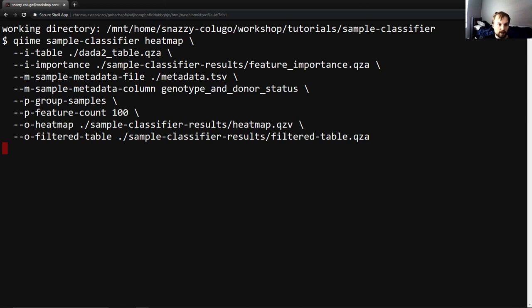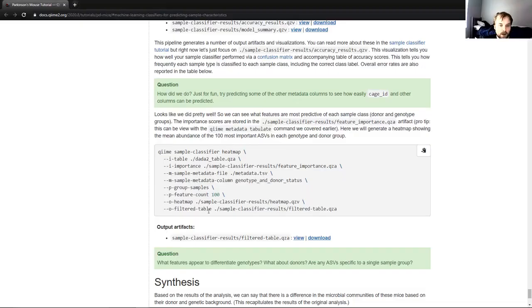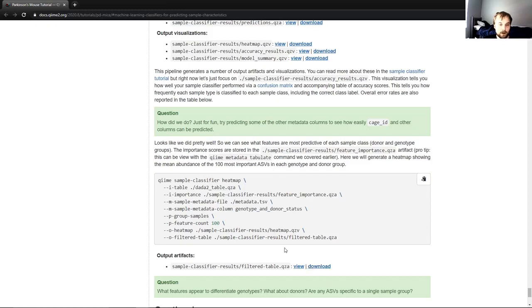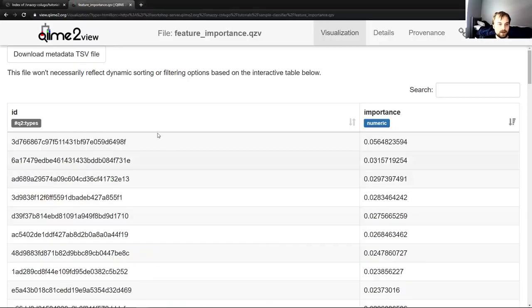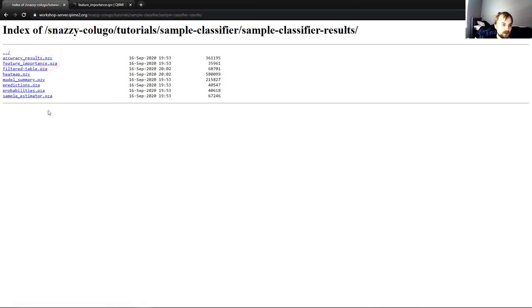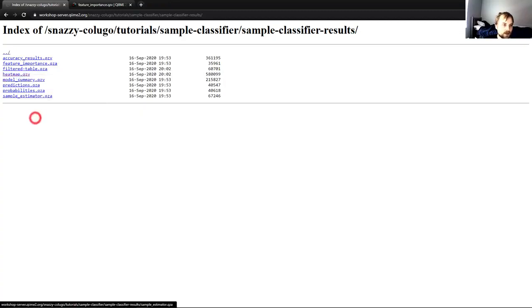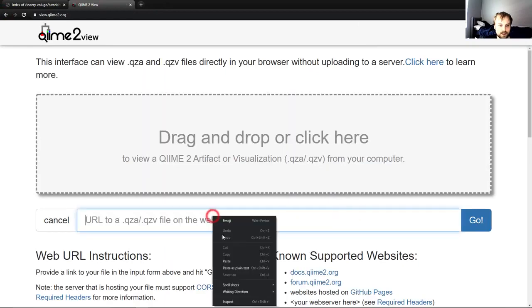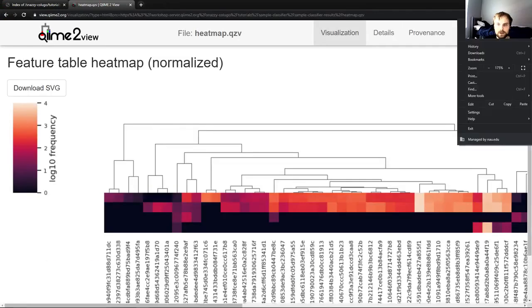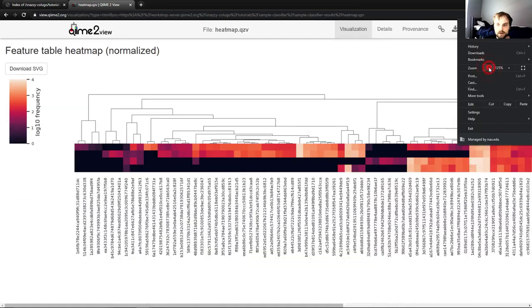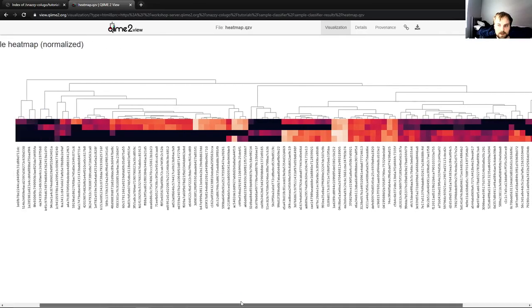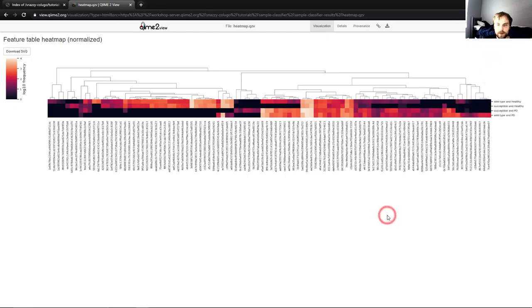All clear for the sake of cleanliness. Paste and go. And once this is done, we'll be viewing sample classifier results heatmap QZV to answer the question that is posed right after this command. So there we have it. And the question, what features appear to differentiate genotypes? What about donors? Are any ASVs specific to a single sample group? Now, we'll go view the heatmap. It might look a bit intimidating at first, but I promise once you get the hang of it, the heatmaps are surprisingly intelligible. So we're going to go to sample classifier results. We're going to take our heatmap QZV, copy the link address. Once again, paste it in here. And for this one, I might actually have to zoom out because this is going to be quite large. Yeah, I'm going to zoom out a bit further. There we are.